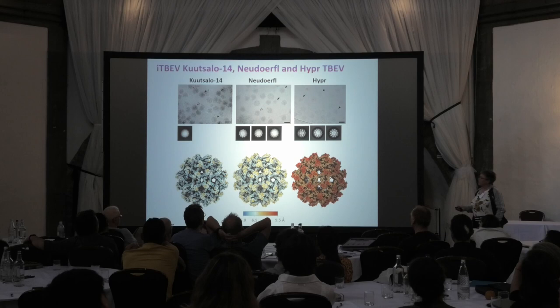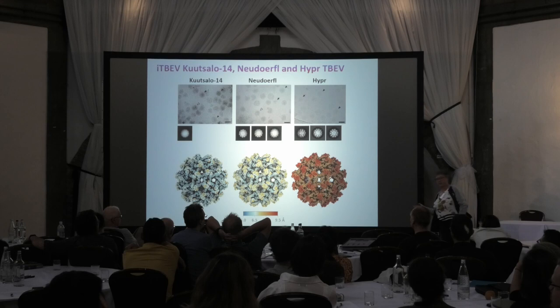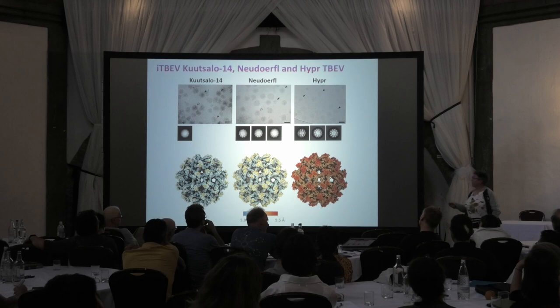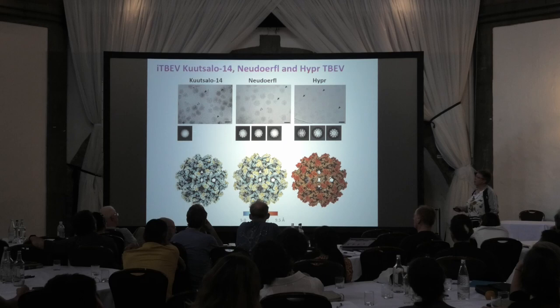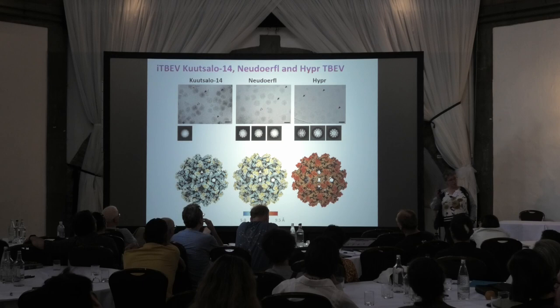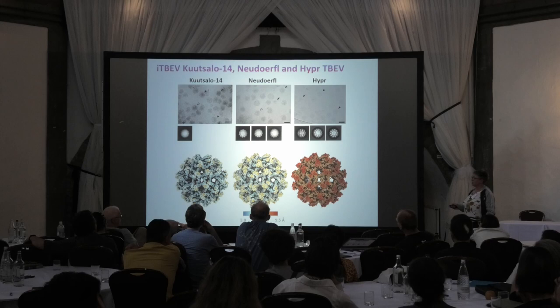So these are produced by taking a normally infected cell, but then throwing in ammonium chloride, preventing the maturation of the virus, because you prevent the change in pH of the Golgi, and therefore you can isolate these non-infectious immature particles. When we did 2D classification of those particles, what we end up with is something that looks a bit weird. It's not very regular. It's well-defined on one side and not on the other side, and we could never really classify that out into other things.